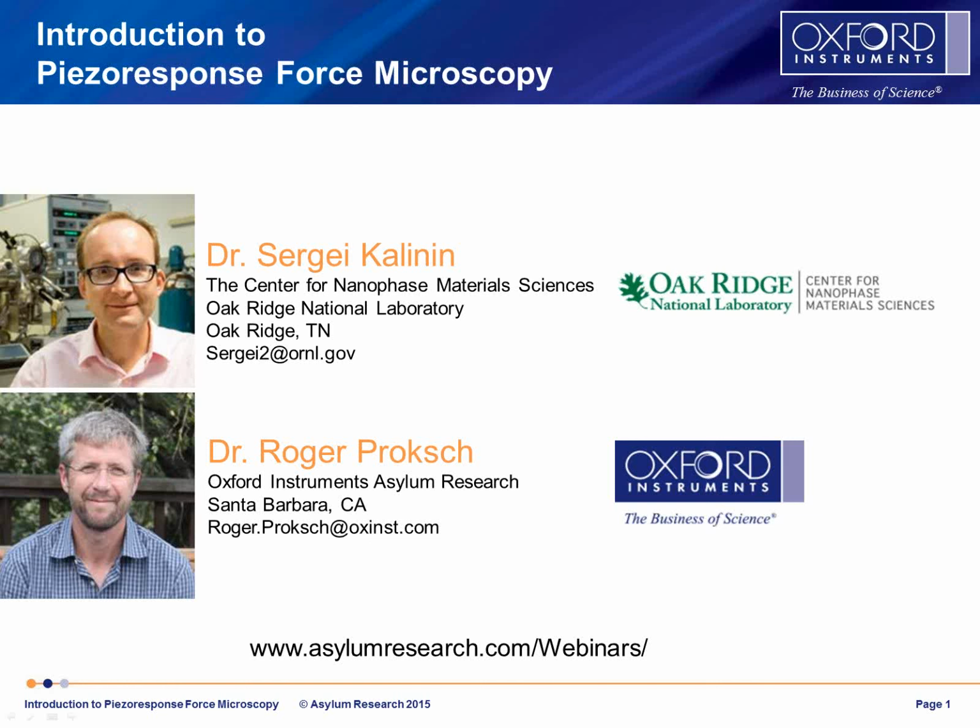Our topic today is Piezoresponse Force Microscopy. Today will be an introduction. If you want to learn more, be sure to sign up for the Advanced PFM webinar on Wednesday of this week.